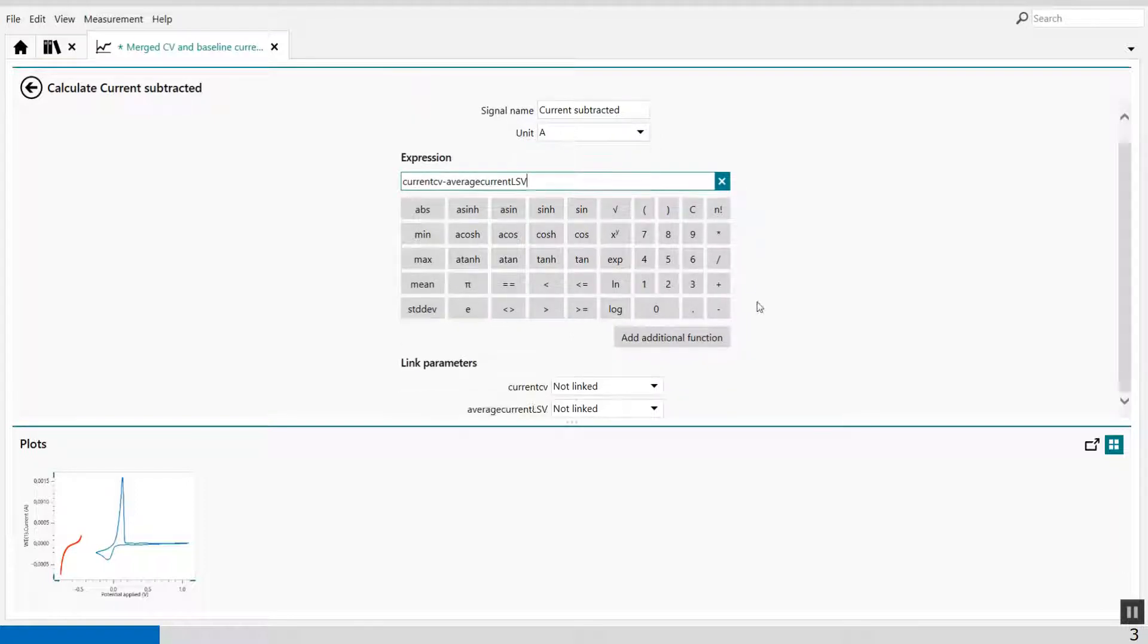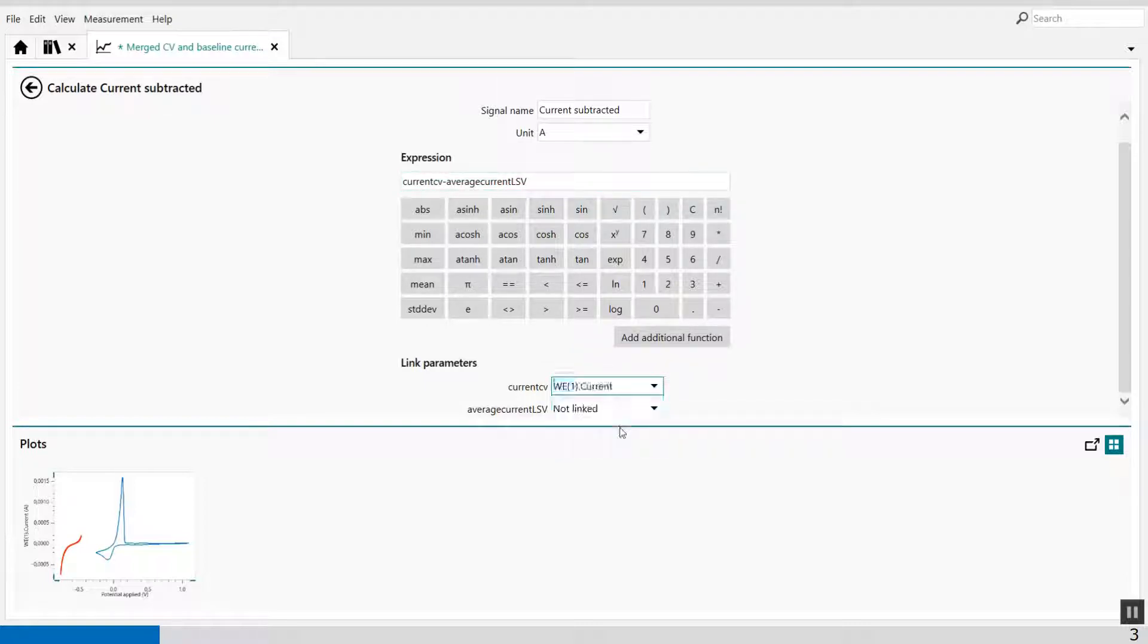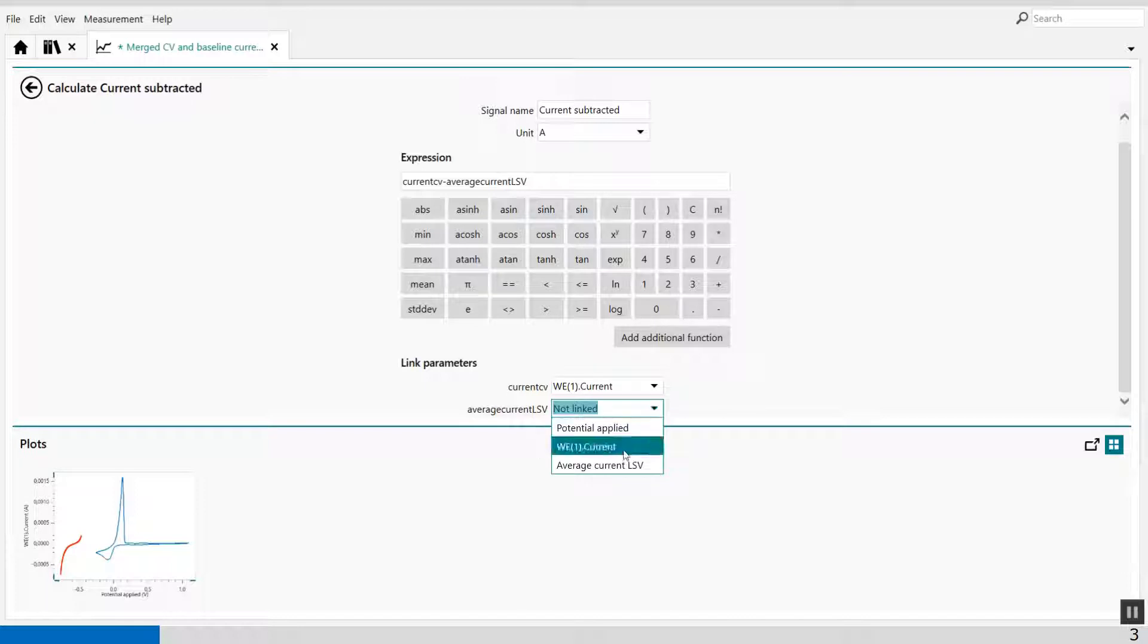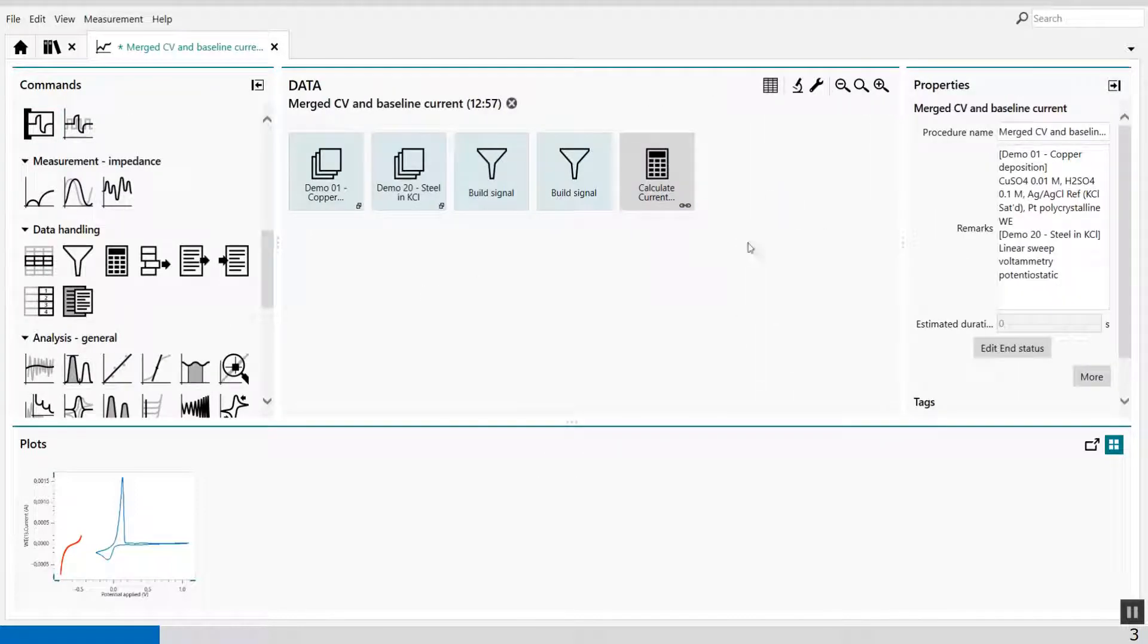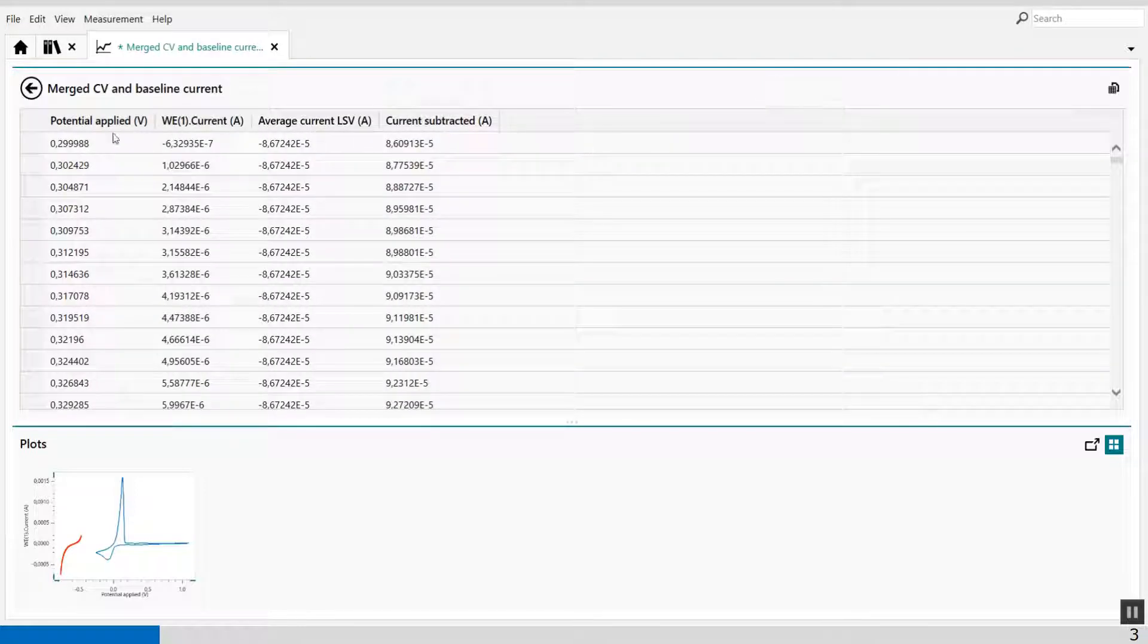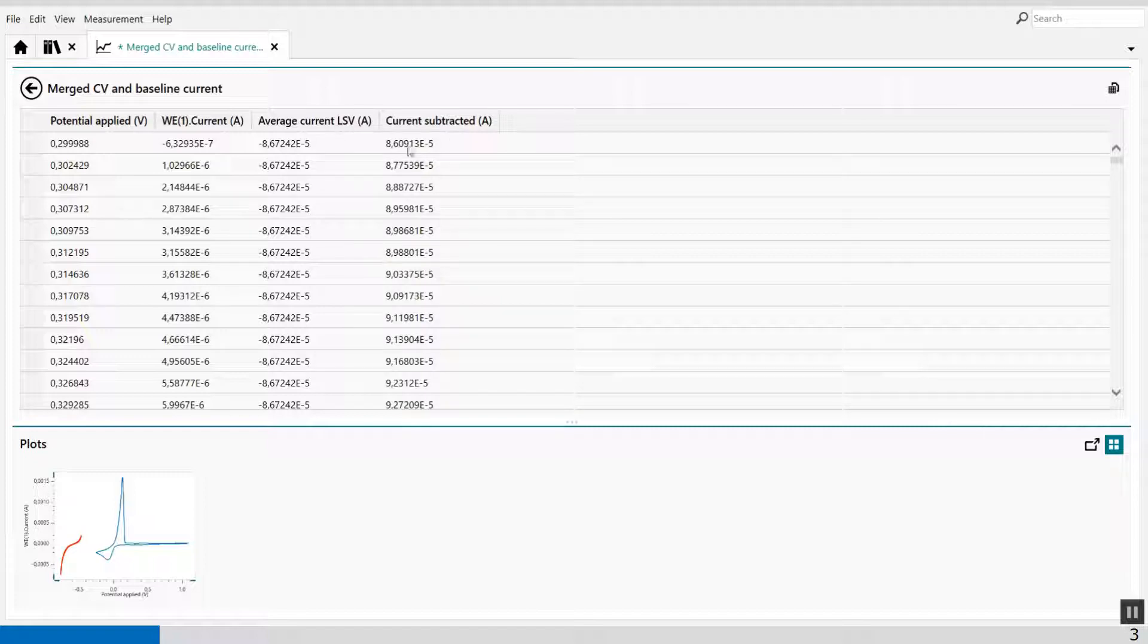The only thing I have to do now is link the parameters which I have defined previously. So I have my current of the CV and I have my average current of the LSV. When I look at my data grid, you will see potential applied, the current of my CV, the average current of the LSV, and the current subtracted.